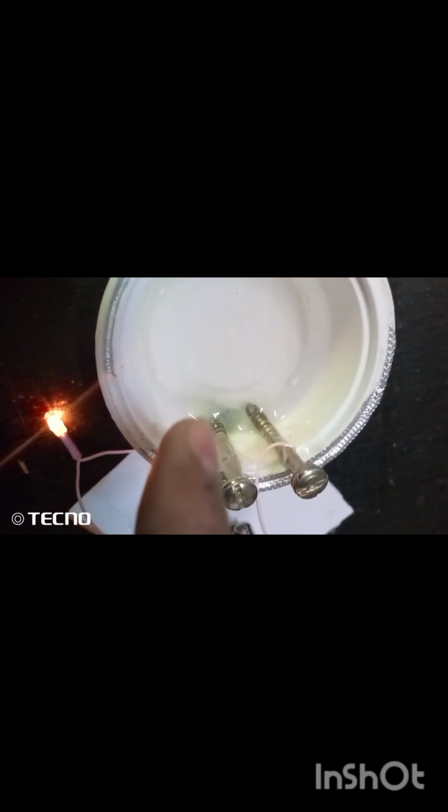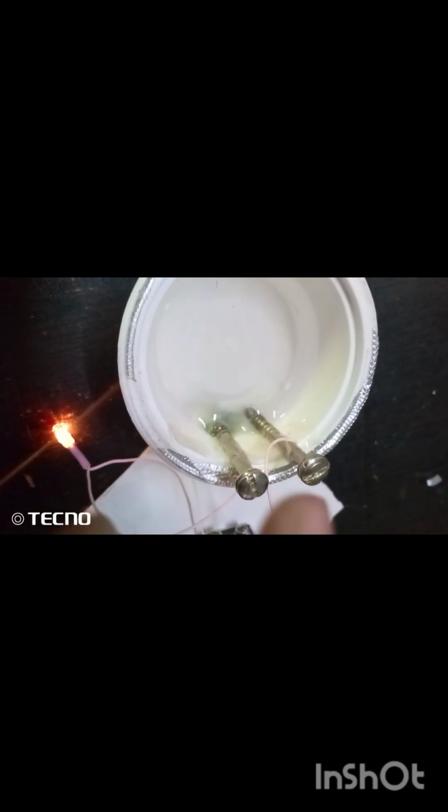And I think even color also evolves. As you can see, this solution has changed from this light color to a grayish type of color. I think electroplating is also occurring here from this metal.